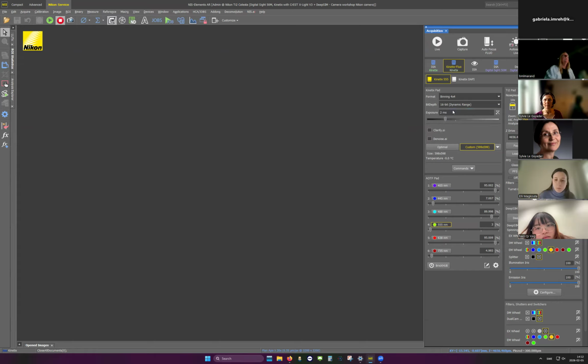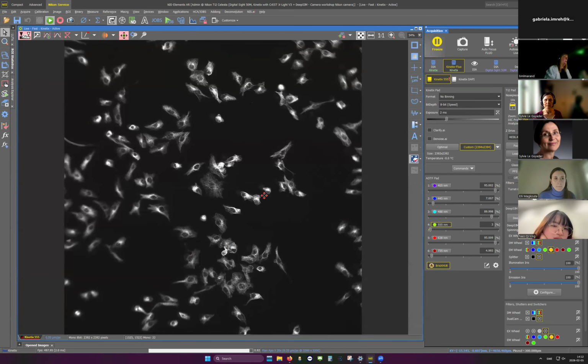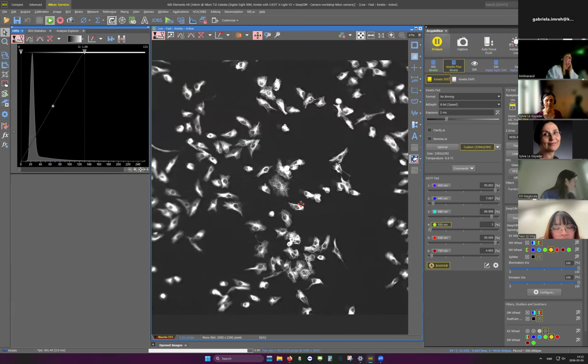And we are going to start here with 8. Now we are running in 8-bit speed. And as you can see here, down in the left corner, you see that the frame rate right now is around 500 frames a second. But I also think that you can start to see, especially if I'm pushing the lookup table a little bit more, you will see that the image is quite noisy.